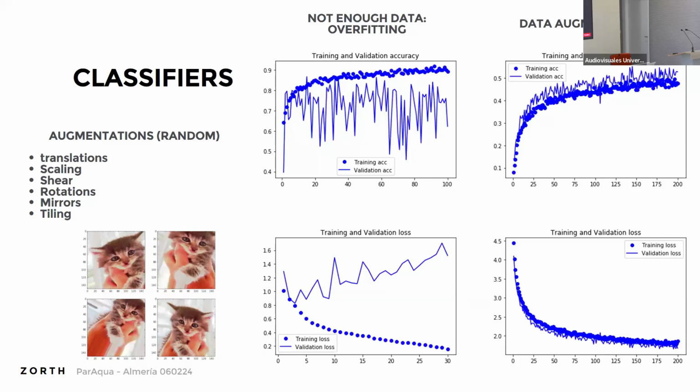And that corresponds to a sort of drop off that actually really helps with your training and validation loss. So when everything is fine, it looks like this. Your training accuracy and your validation accuracy, they go hand in hand, and the same for training and validation loss.